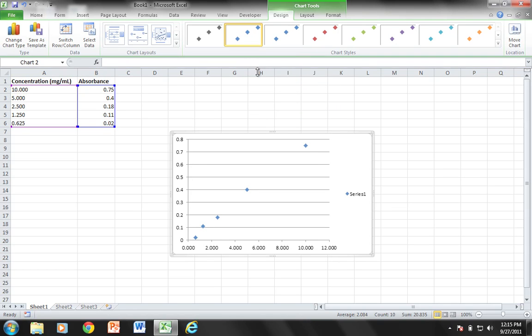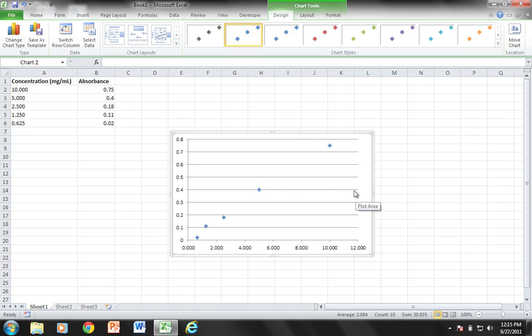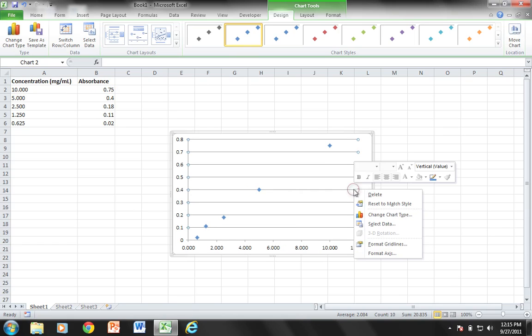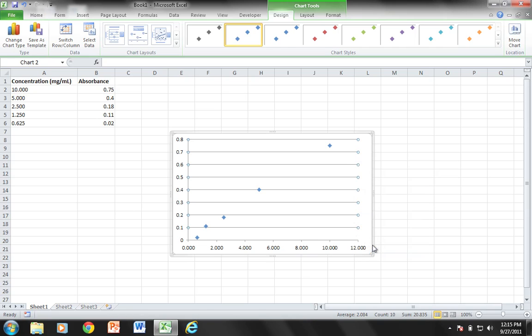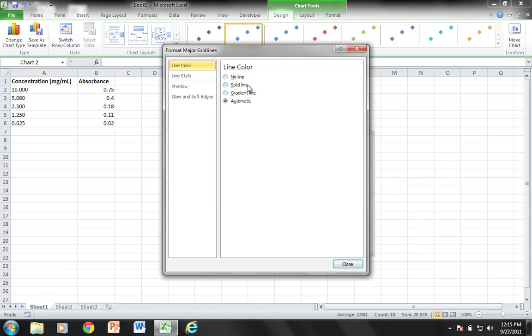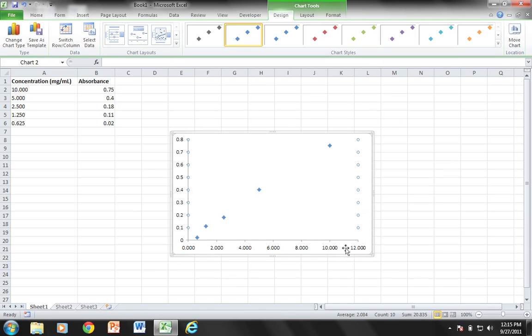Again, I'm going to clean this up by removing the series title. I'm going to format grid lines and choose no line, close, and then I'm going to come to my axes and format my axes.